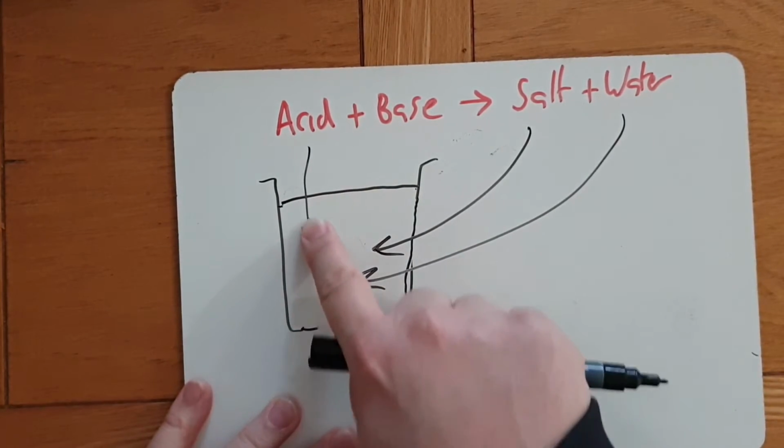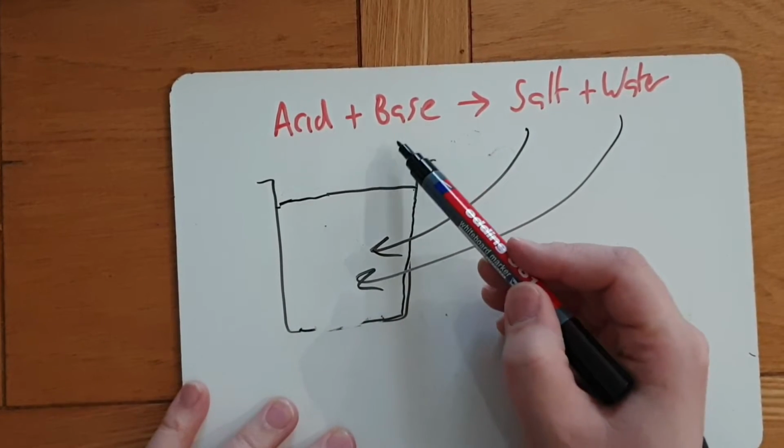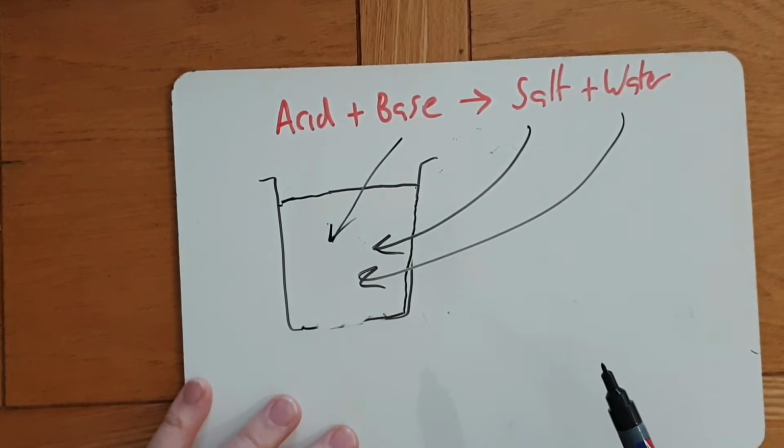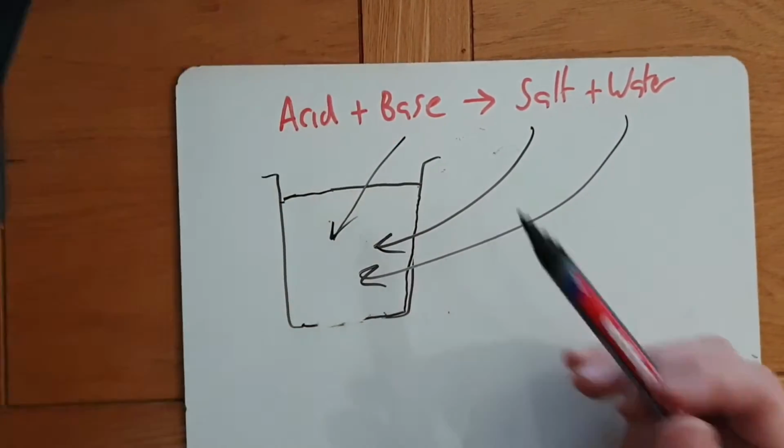Or if we didn't add enough acid, that means we would end up with some base left.